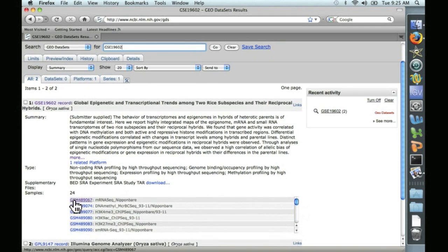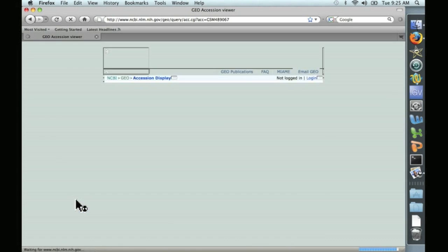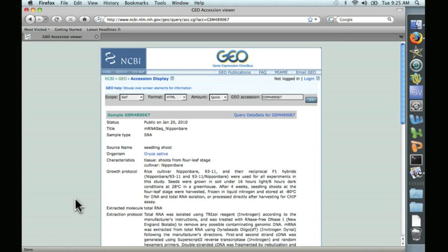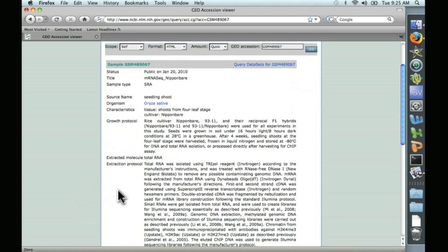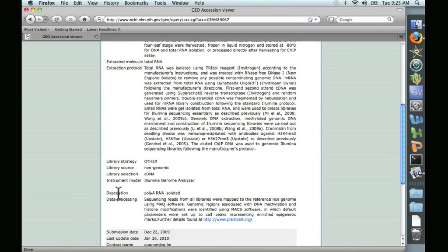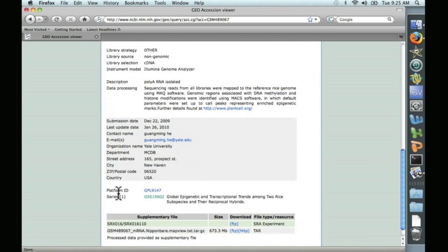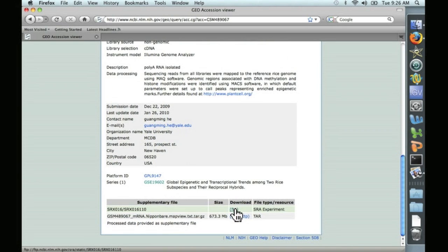We're interested in the first one, the mRNA sequence data, because we're looking for RNA expression data that we're going to align to a cDNA database. Let's go ahead and click on that. And that takes us to a description of the sample, how the RNA was extracted, etc.